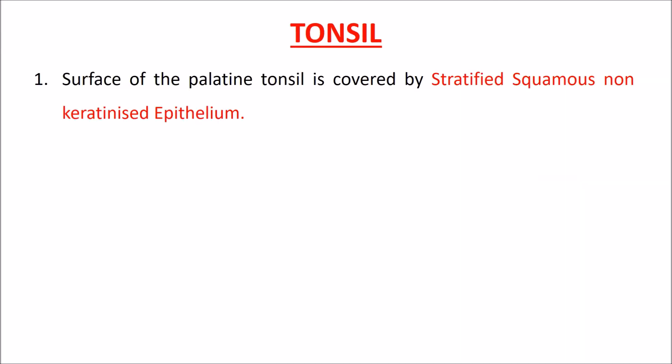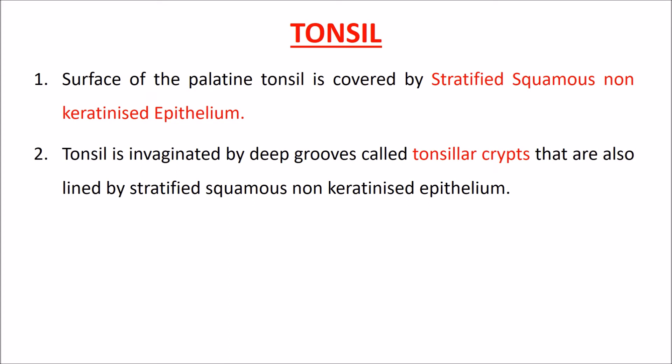Tonsil: the surface of the palatine tonsil is covered by stratified squamous non-keratinized epithelium. The tonsil is invaginated by deep grooves called tonsillar crypts, which are also lined by stratified squamous non-keratinized epithelium.